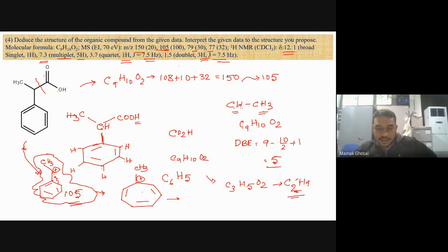So it will be delocalized over the ring. It generally looks like this, with a ring of seven carbons, and this is methyl. You calculate this molecular weight. This is also 105. I have not changed anything, I have just made a rearrangement. So this is the 105 ring.